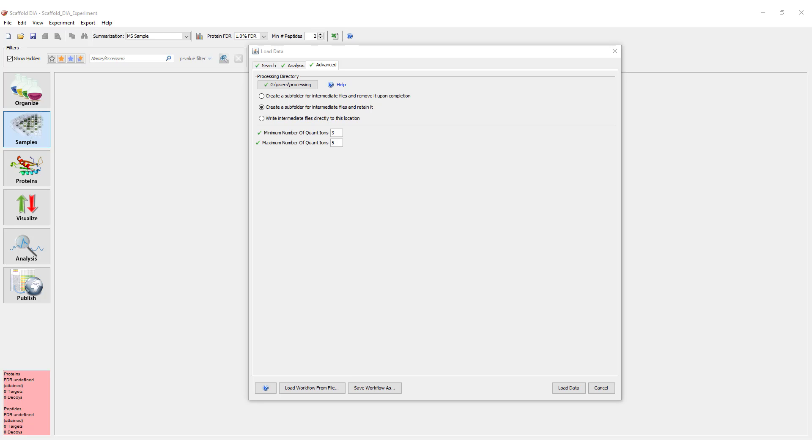Options for how files are managed include: create a subfolder in the set processing directory and delete intermediate files once processing is completed, create a subfolder in the set processing directory and retain intermediate files after processing is completed, or save files directly to the processing directory without creating a subfolder.